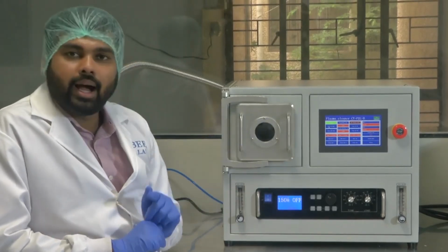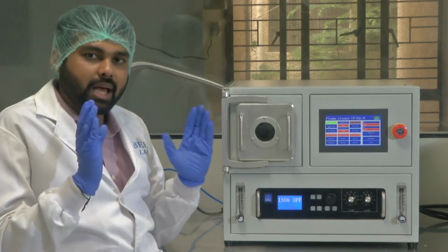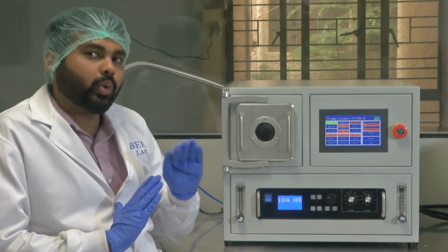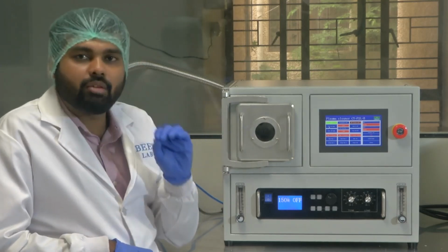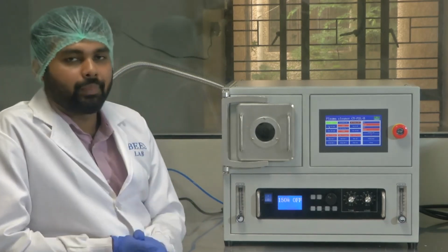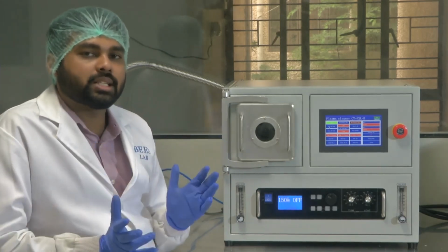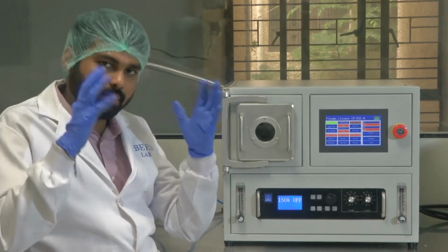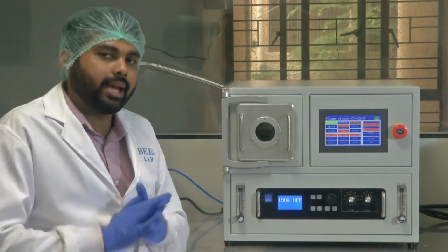As you saw, the pressure value dropped very rapidly from that very high value to a reasonable low value of 100 Pascals. But after that, it takes a lot of time to reduce 1 by 1 Pascal. Why is this so? This is because when you start off, what is vacuum creation? It's basically you are removing atoms and molecules of different gases from the milieu and taking them out and creating an empty chamber ideally.